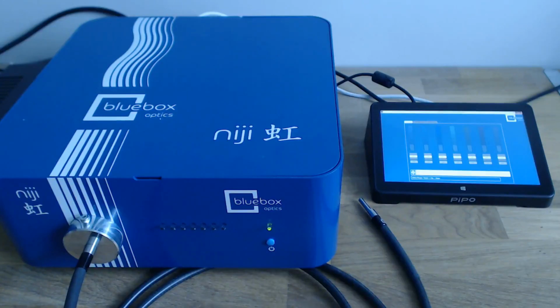Hi, my name is Igor, and today I will demonstrate how to use the niji 7-channel LED light source from Blue Box Optics with Micromanager.